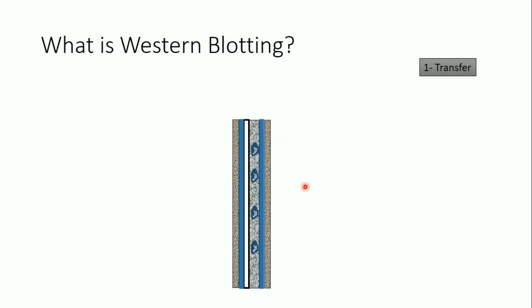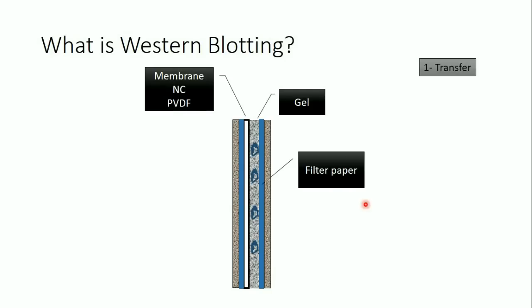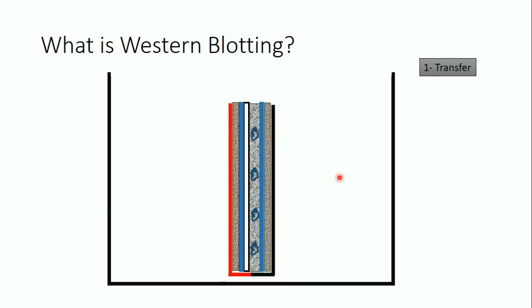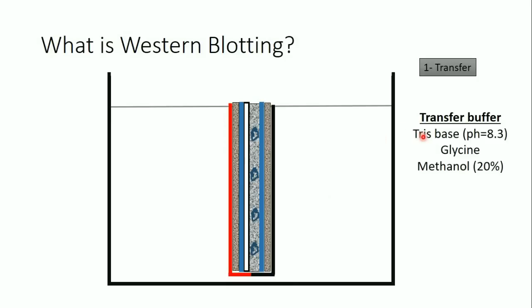So in the plastic container I have the filter paper, the gel, the membrane, and the sponge. I place everything in a chamber and fill it with a buffer called the transfer buffer. This buffer is composed of Tris-base at pH 8.3, glycine, and methanol. Methanol is very important in the transfer buffer because it is used to detach SDS molecules from the proteins and facilitate the proteins binding to the membrane.